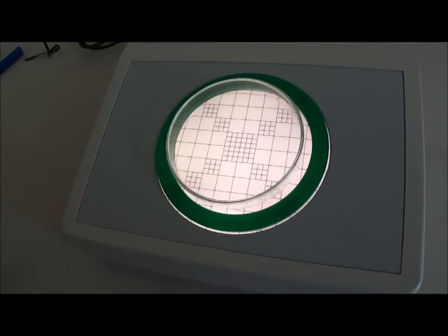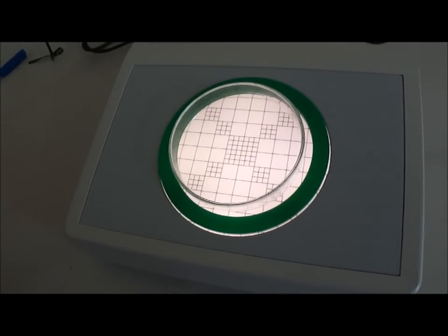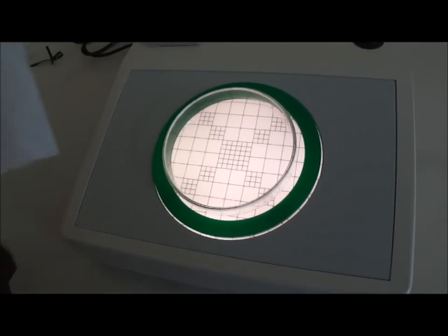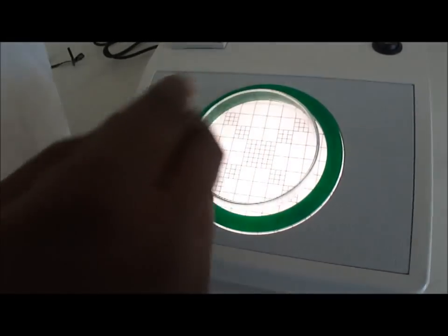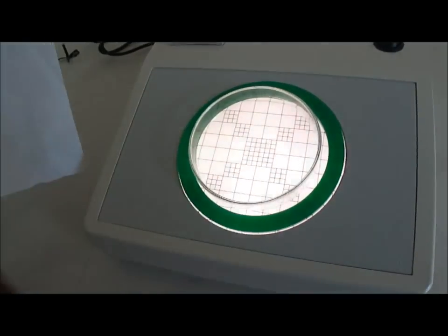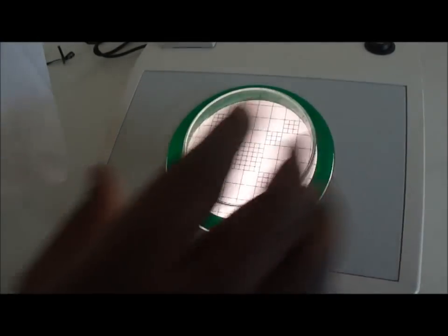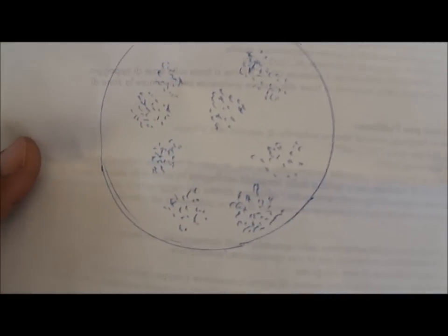The bacteria colonies will be on the top of your agar inside the petri dish, as this for example, as you see here, you have a certain number of colonies here.